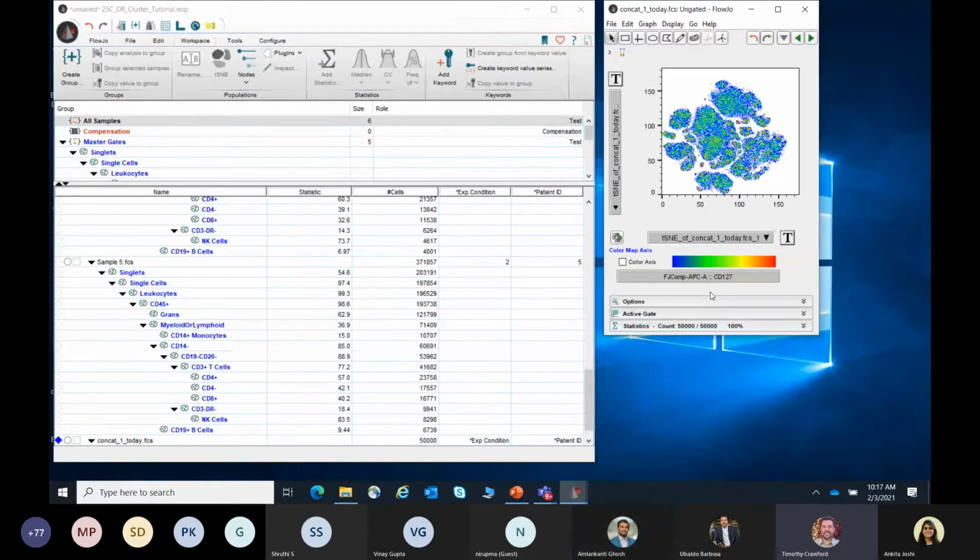And Kate's going to show how to install it in terms of our setup here in a little bit. But it's always worthwhile to read about the options before you start clicking all of the different buttons to turn on and off options within these user interfaces.